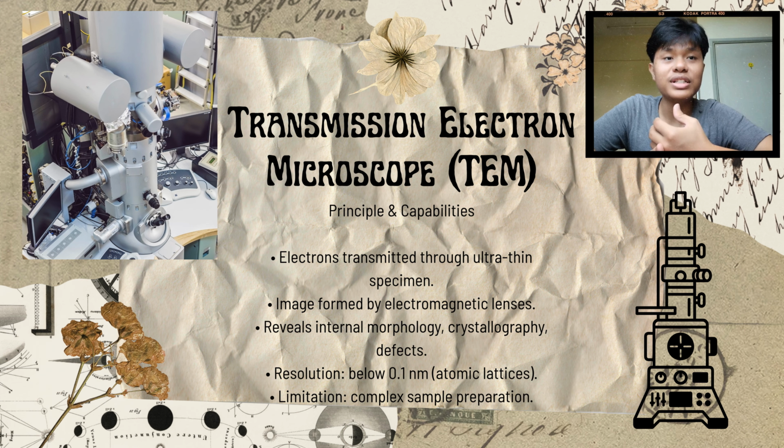The image reveals internal morphology and crystallography defects, and the resolution is below 0.1 nanometer, which is atomic lattices. The only limitation for this microscope is the complex sample preparation.